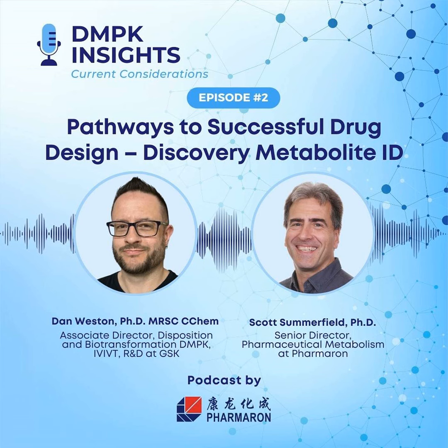So it's something that is really important to do, but of course then that needs a different kind of strategy. So we're not doing fast development, we're doing something that's fit for purpose and that meets the time scale for early discovery, particularly in LI and LO, where you have to meet more readily the demands of design, make, test.